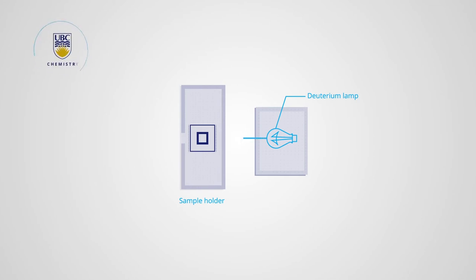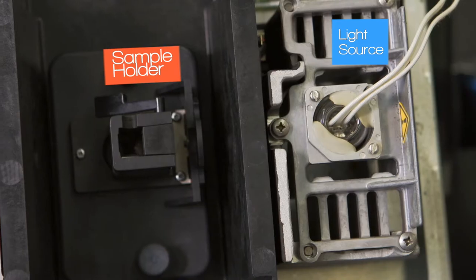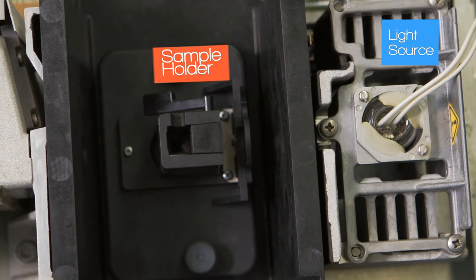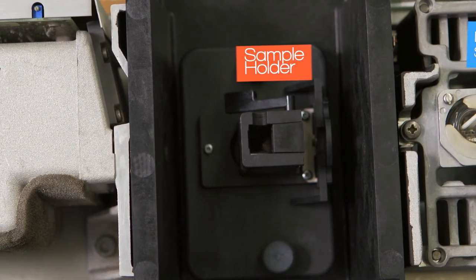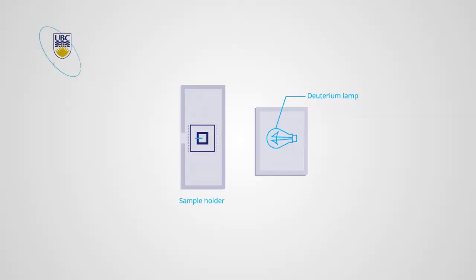The light beam is focused from the source into the sample holder. The sample holder for this instrument can only hold one cuvette, thus we need to measure the reference solution before measuring the sample solution. The light travels through the cuvette and into a small opening on the other side.